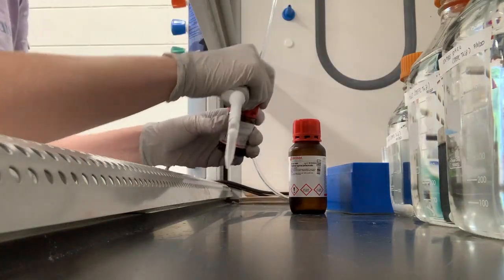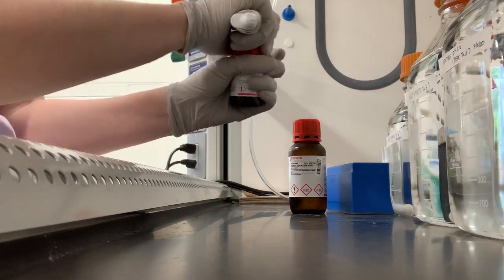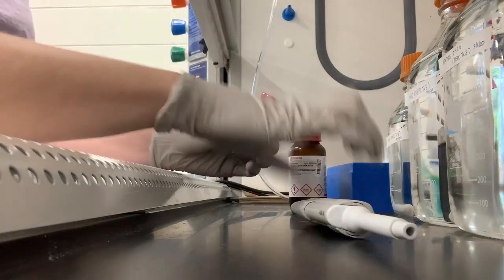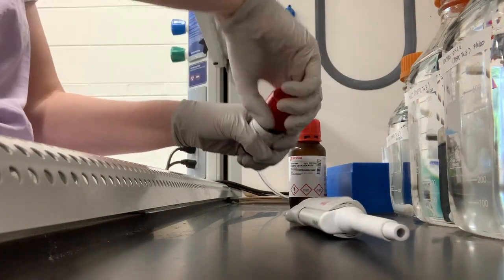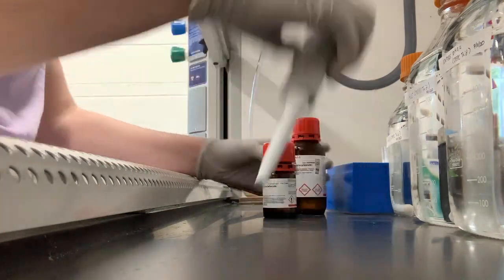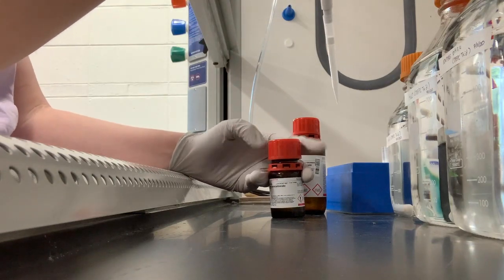I'm a little too tall for this hood, so I sort of have to adjust myself. This lid is not very easy. Maybe loosen the lids before you get your pipette. So you're going to keep this tip sterile.